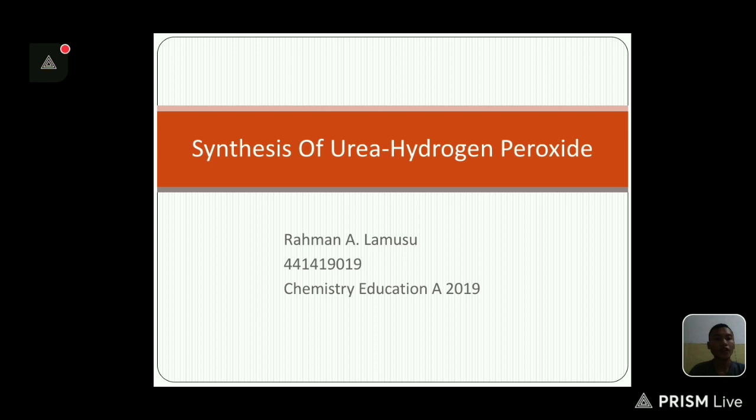In this video, I will explain an experiment entitled Synthesis of Urea Hydrogen Peroxide.